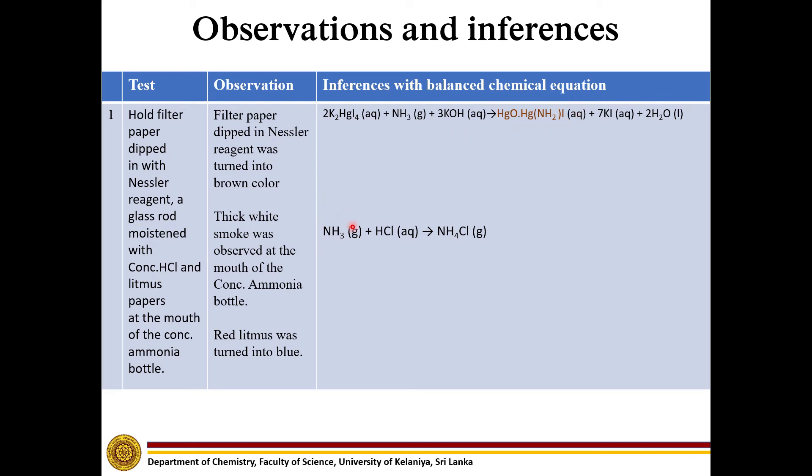When ammonia gas reacts with concentrated hydrochloric acid, it forms thick white smoke of ammonium chloride.